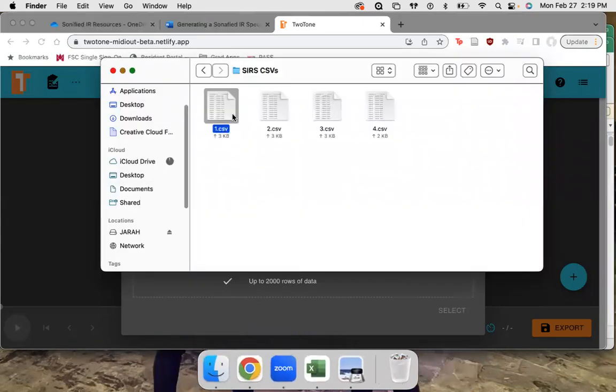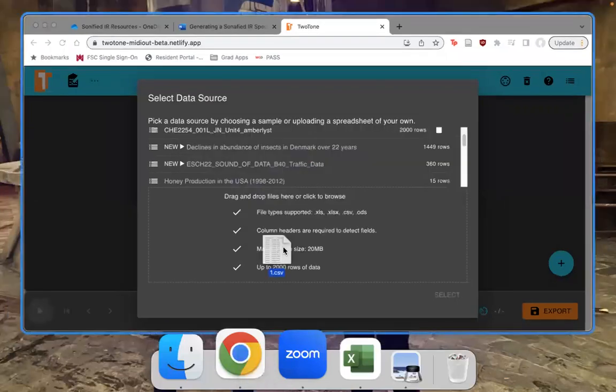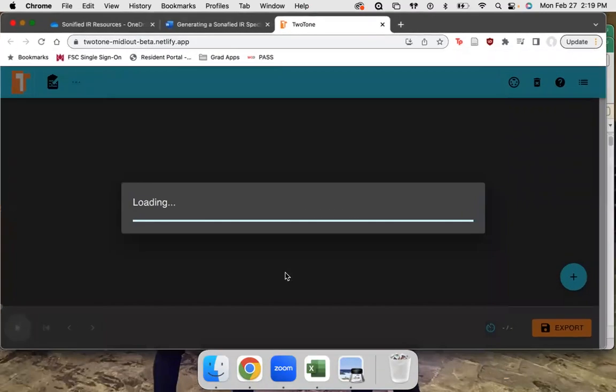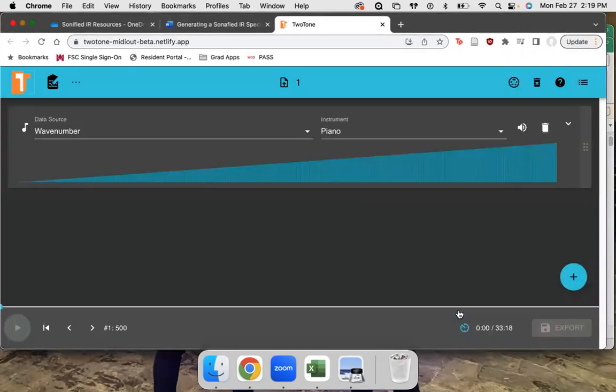I did not do that correctly. Then it should be selected and press select.